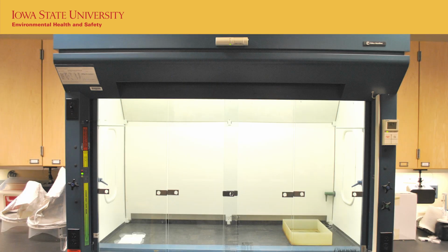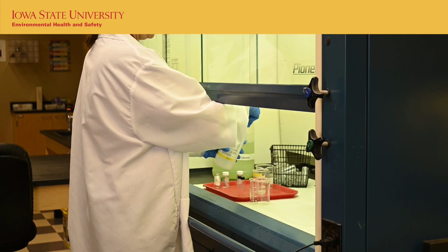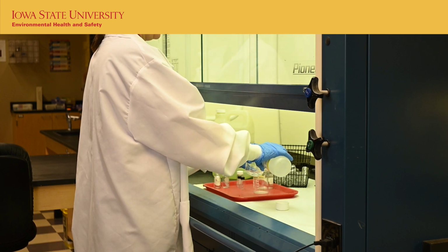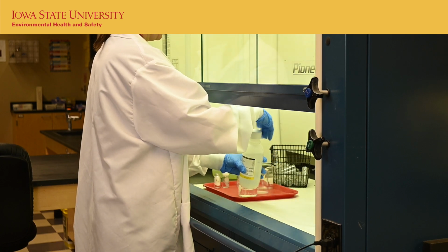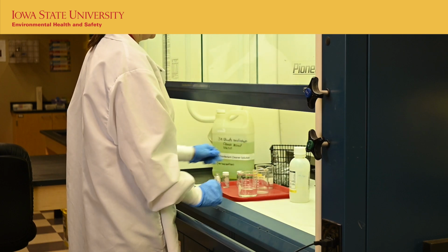If your lab has a fume hood, ensure that it's certified, which is indicated on the certification log located on the fume hood. EH&S certifies fume hoods on campus annually. If your fume hood malfunctions, is broken, or an alarm is going off, please contact EH&S and we can help coordinate with the Facilities Planning and Management (FP&M) department to fix it. EH&S will retest for proper airflow once the fume hood is fixed before you can resume work.